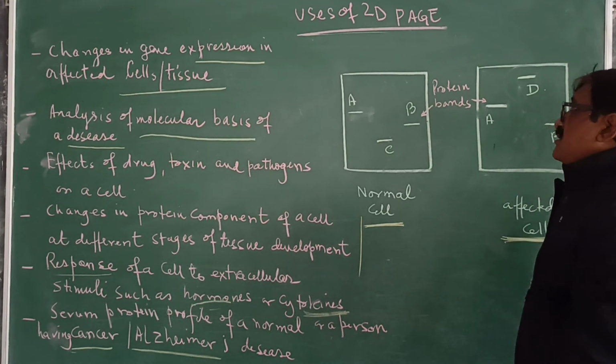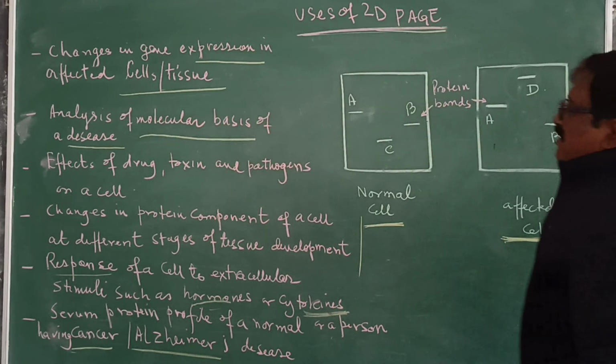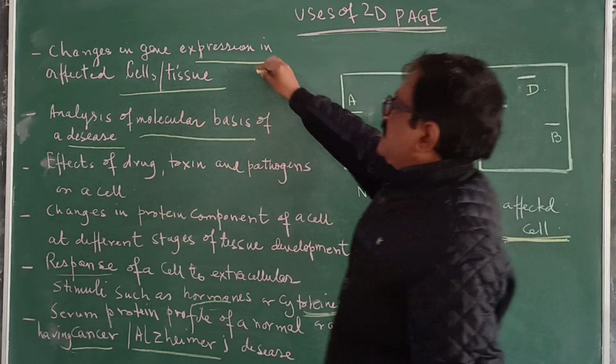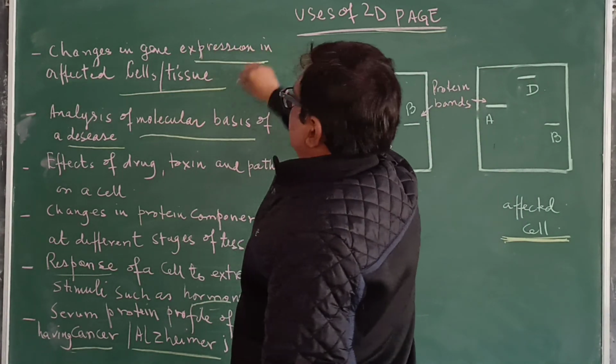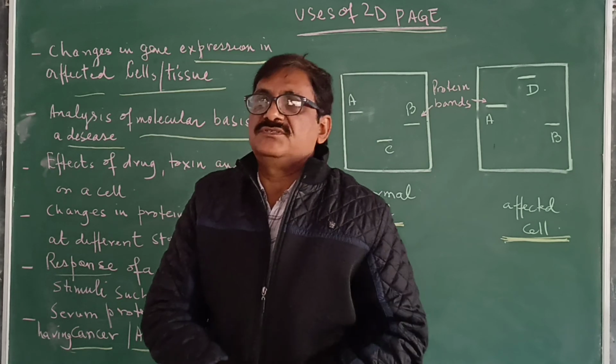So these are the uses of 2D PAGE, mainly by studying the changes in gene expression in affected cells. So these are the uses of 2D PAGE.